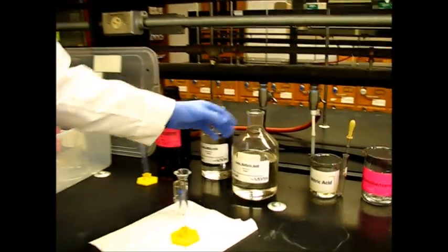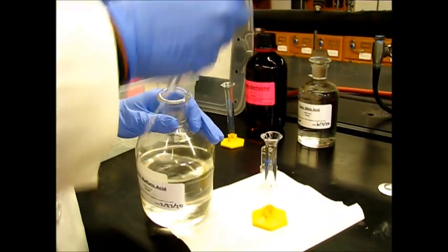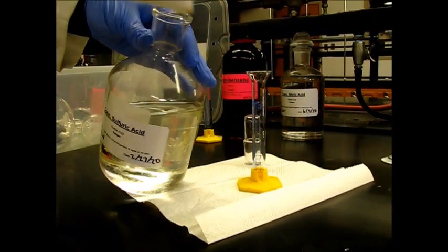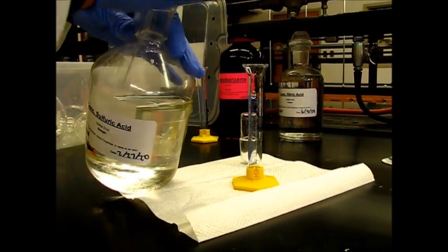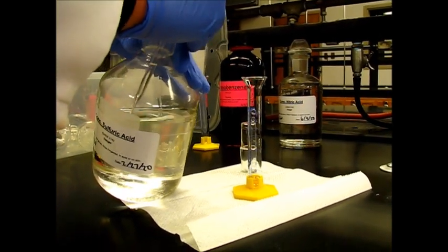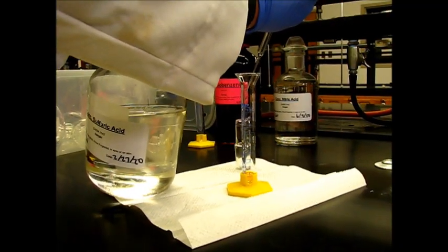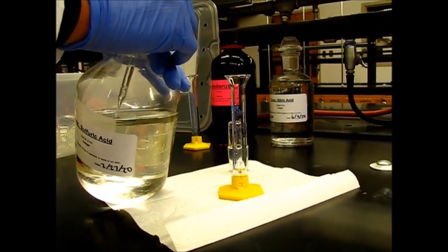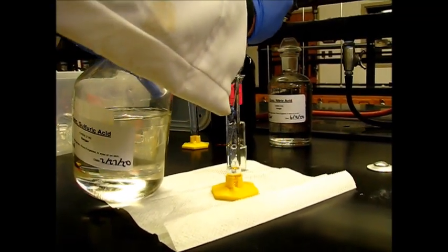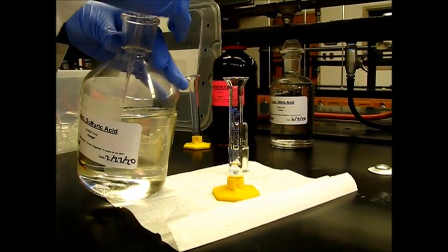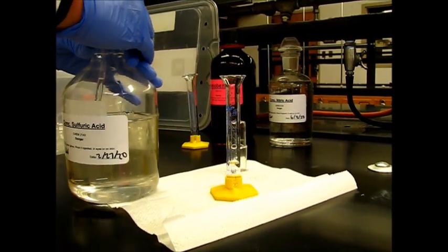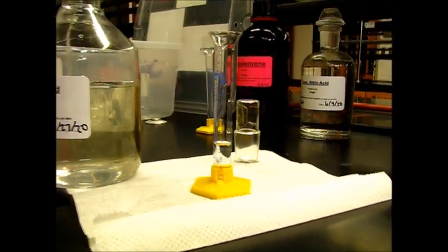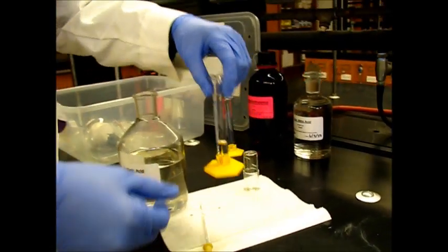First, we're going to measure out four milliliters of concentrated sulfuric acid. Almost there, just half a mil. That's it. So we're going to go ahead and add this into the round bottom flask.